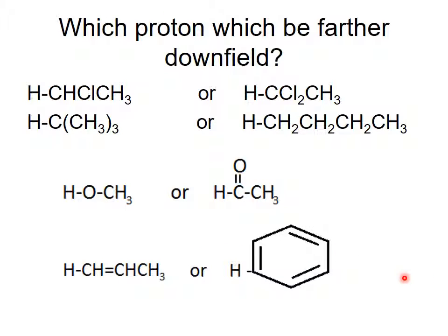So now looking at these, I want you to identify which hydrogen, the one that stuck out on a bond, would have an absorbance that is more downfield. Remember, downfield means that you have a larger parts per million, and so that it's more deshielded.